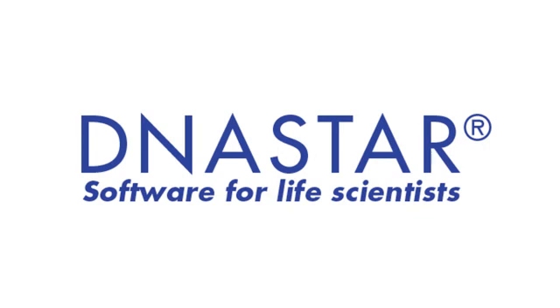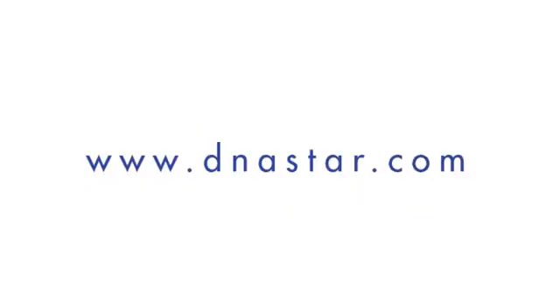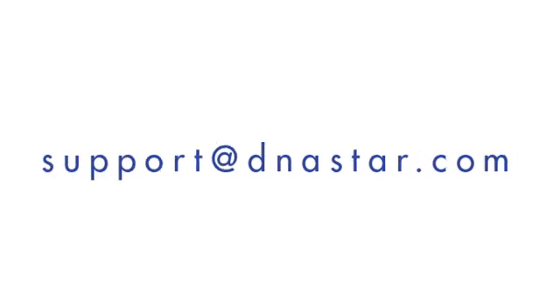If you have further questions about using the SNP report in SeqMan Pro or any other questions about our software, please visit our website dnastar.com or contact us at support at dnastar.com.